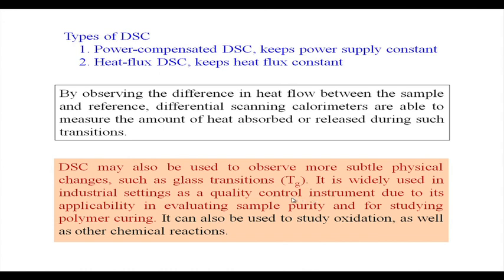If you have an impurity in a solid sample, there will be some change in the melting point. That is the depression of the freezing point and the elevation of the boiling point, as we know from our school days. That criterion we can use to monitor the glass transition temperature. If we have a fixed glass transition temperature for a particular pure sample, that can be tagged with that sample.